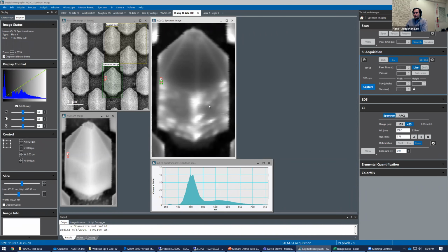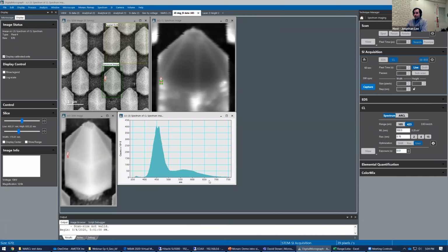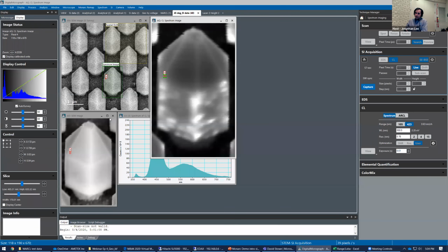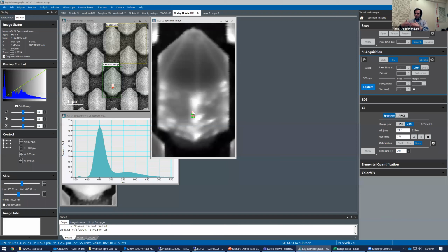The information that we get from a typical specimen is coming out in wavelength, right? So it's in the wavelength basis whenever we get it, because the dispersion of a grating is based on length, right? It's X amount of grooves per millimeter. So the information you get out of it is dispersed by wavelength and not energy.